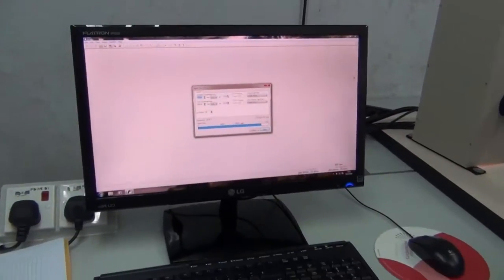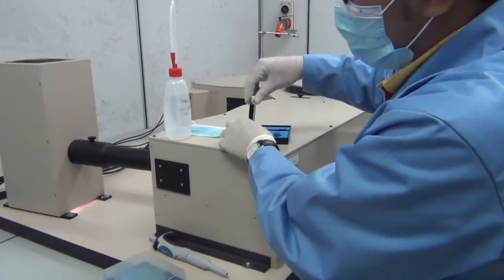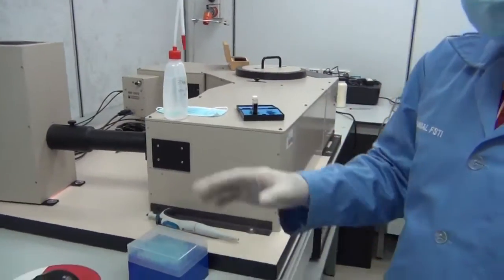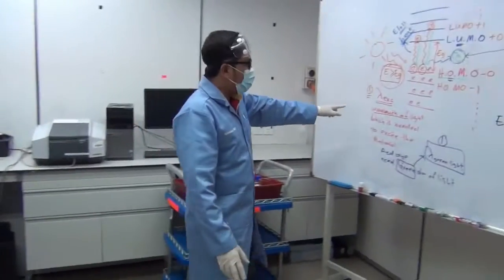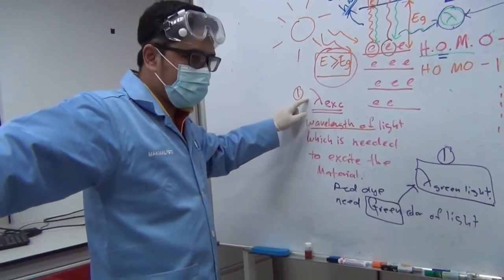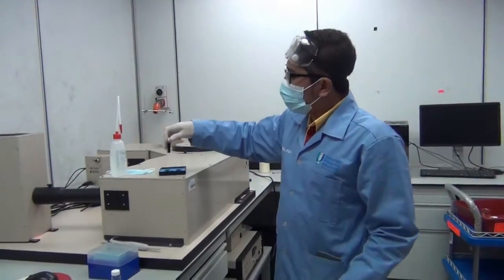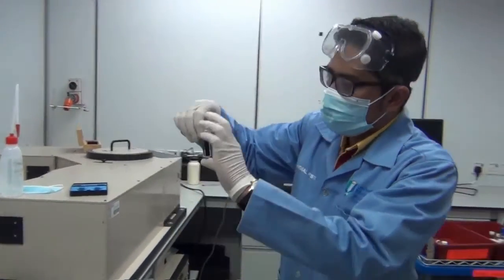So again, don't forget to close the lid. Close the lid. This is the lid. Close it. Again, we need to predict the excitation wavelength. This excitation wavelength we need to predict based on the color of your sample. Now, this will be based on your naked eye. What color is your sample?